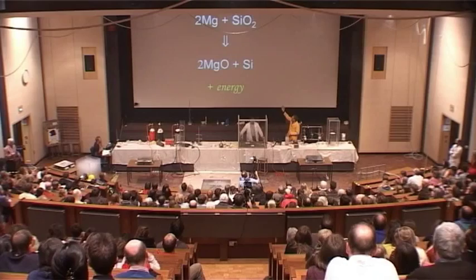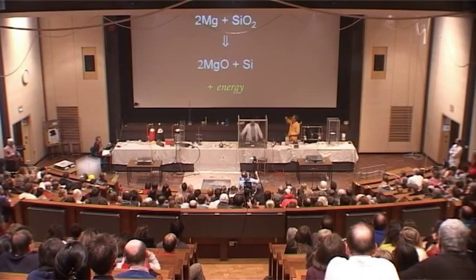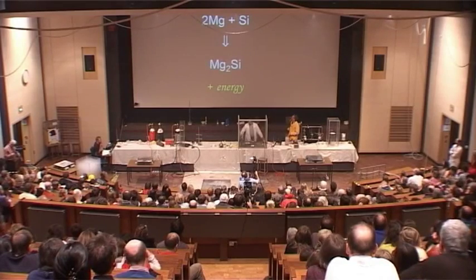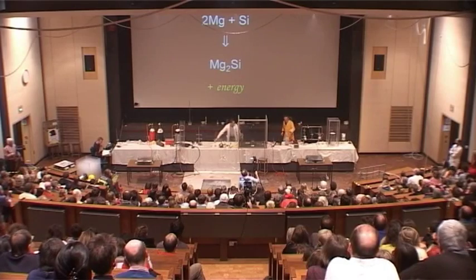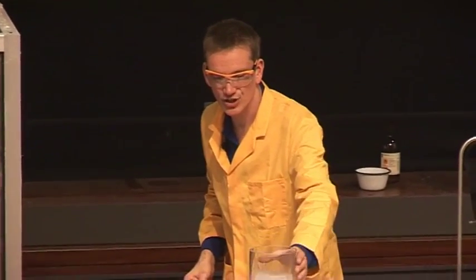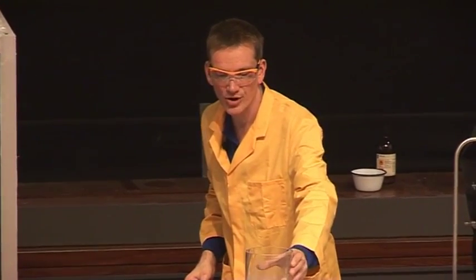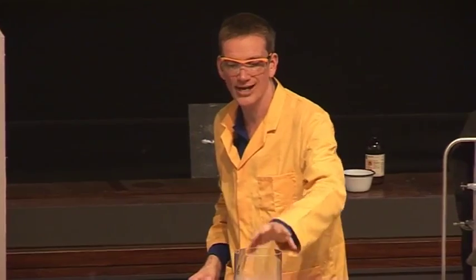The silicon that's formed here can react with more magnesium, and it forms magnesium silicide. This was the substance we had in the tube that's still crackling away, forming silane gas as the bubbles come into contact with the air.